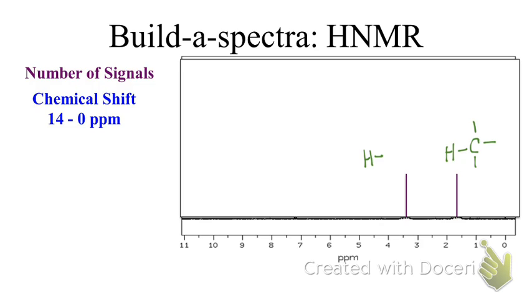Do you have an OH? No. So can that atom be an O? No. Could it be a nitrogen? Why not? It's not. There's no NH stretch in our IR. How else could we find this?